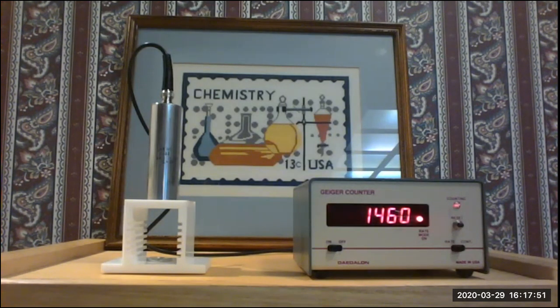What we get after 3 minutes, we have 1148, so that's less than half. So that's telling us, just based on our raw data, that we should end up somewhere between 2 and 3 minutes. So that agrees with what the literature said, that it was at 2.55 minutes.